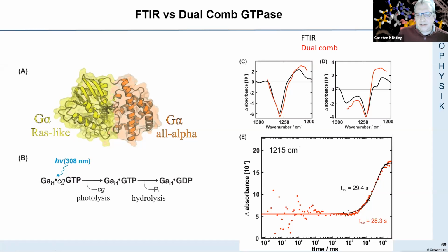Usually, if you have a protein reaction, signal to noise is not good enough to use a single interferogram for data analysis. So usually we use double-sided forward-backward mode and then add 4 interferograms into 1, and with 4 wave numbers resolution, which I think is what we use here, we get 50 milliseconds. But this is for the smaller proteins. If you have larger proteins, we sometimes add 10 interferograms or so and then have 100 milliseconds. Okay, what was the resolution? Just 4 wave numbers.